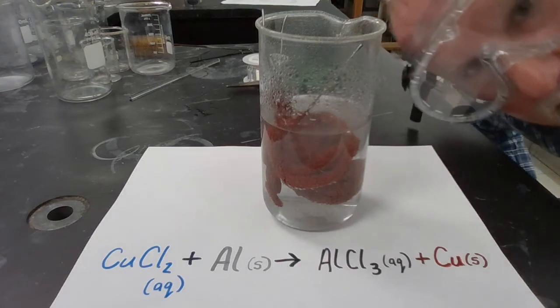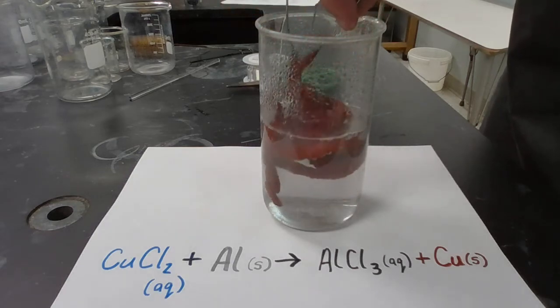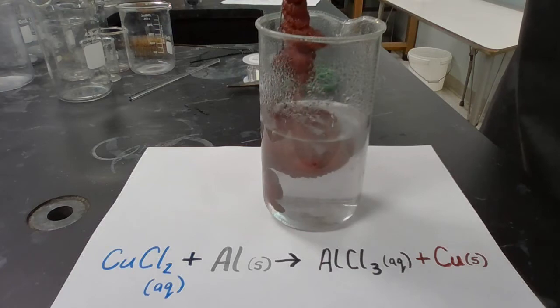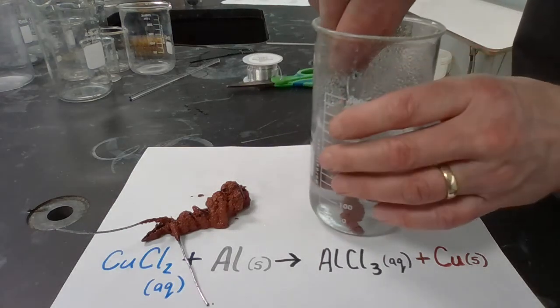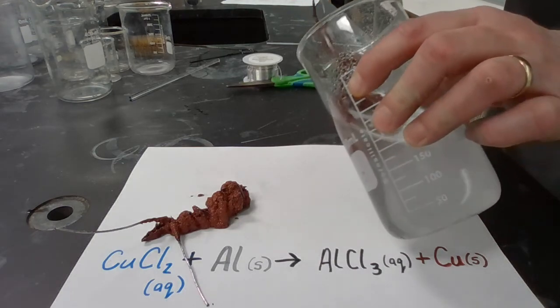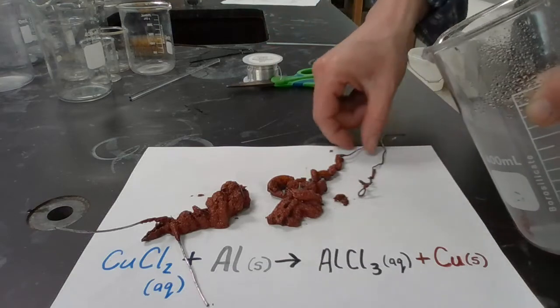So there we go. We did it. It's in there. I see it. Right, so let's just play around with this a little. Oh, that's a lot of spongy kind of coppery stuff. See if I can get it to come out. And poof. Oh, yeah. That's some good stuff. All right, let's get this out too. Oh, I got you. There's some good stuff there.